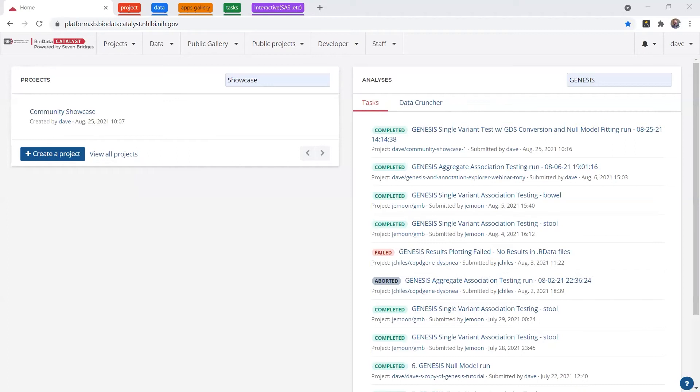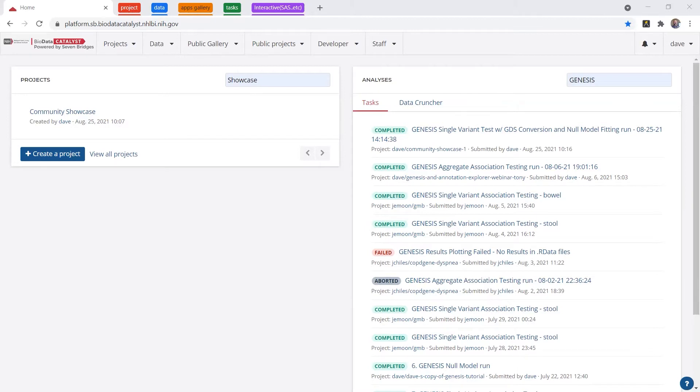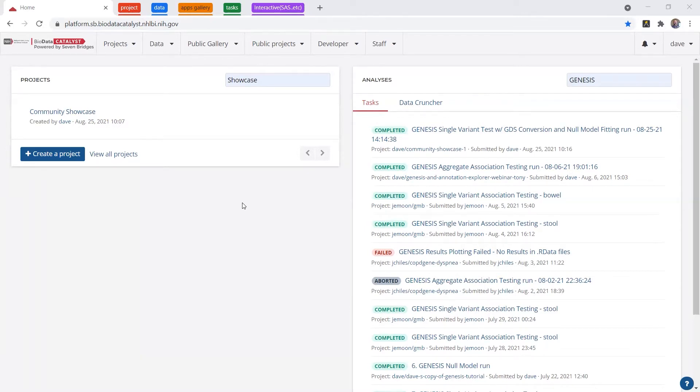I'm Dave, and my colleague Tony is also on the call, so we'll be available to answer questions after the presentation section. But I've already logged on to the Biodata Catalyst Powered by Seven Bridges platform, so what I want to do is give you a tour of some of the features and try to highlight some of the differentiators, just like Tiffany did.